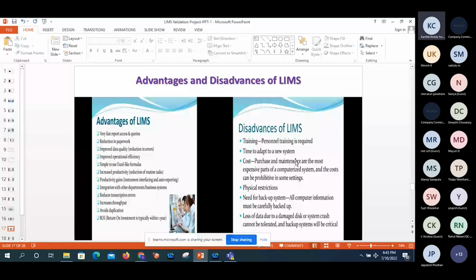As for disadvantages, training can take more time for the end user to understand the things and adapt to the new system.